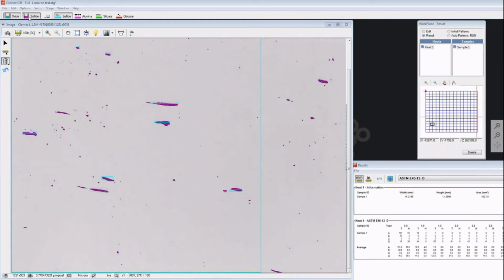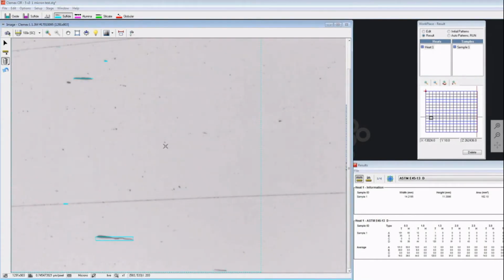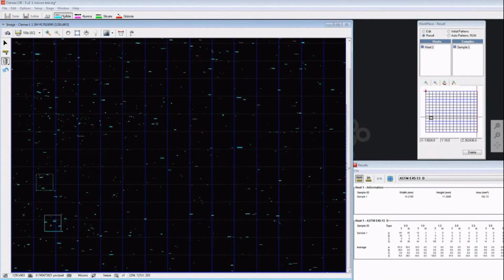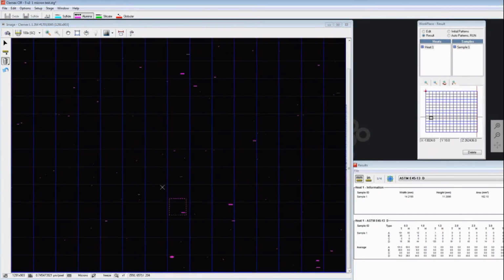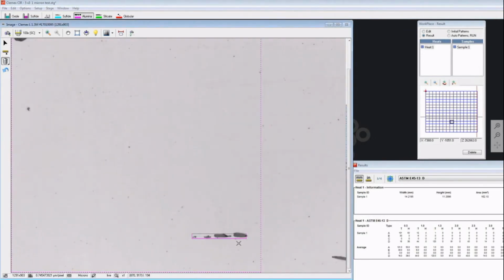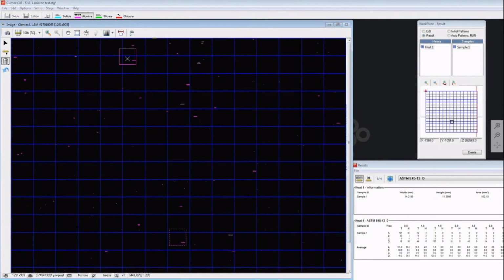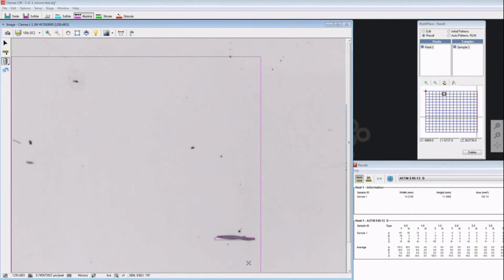We're going to deactivate our threshold, and those seem good. When I look at our thin inclusions for sulfides, this also seems good. Next is alumina. This is the thin inclusion. This is also good, has a rough shape. And our heavy inclusion, also good.